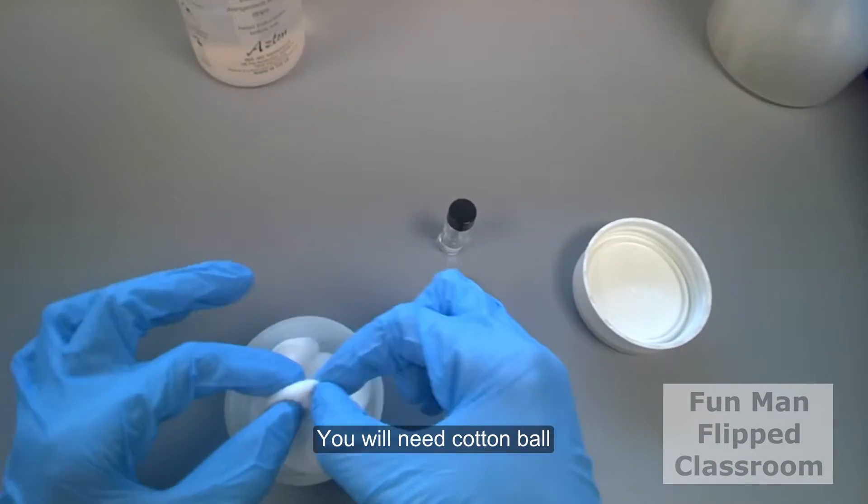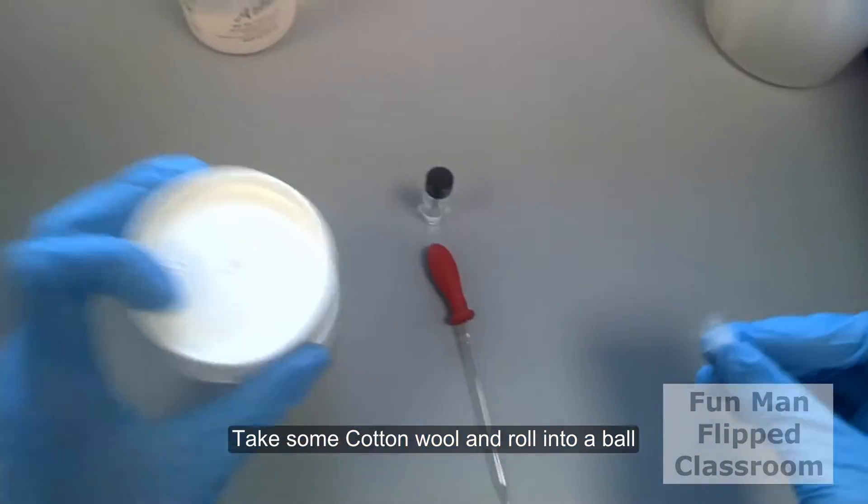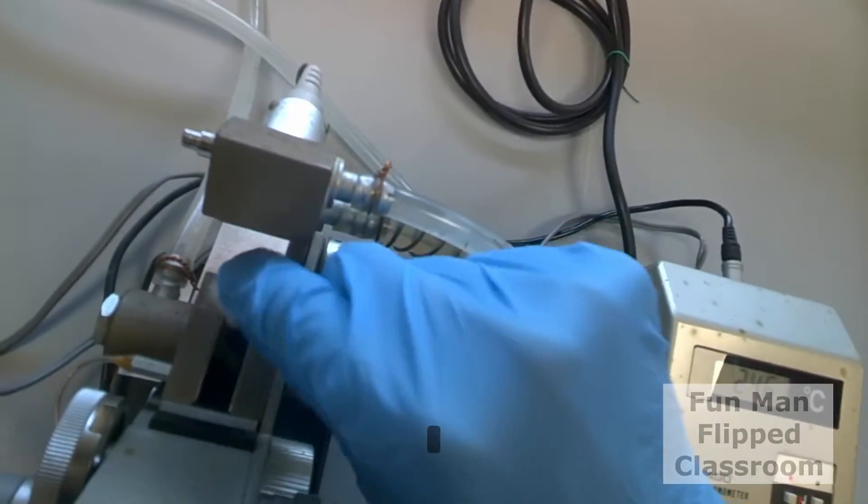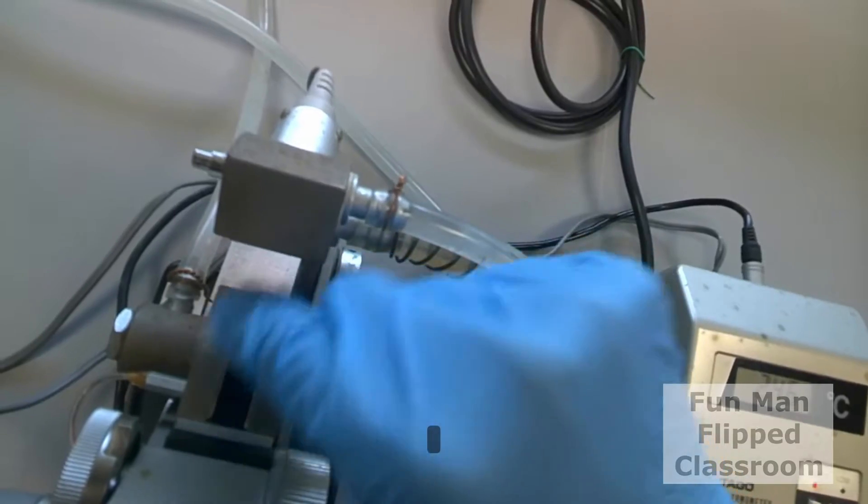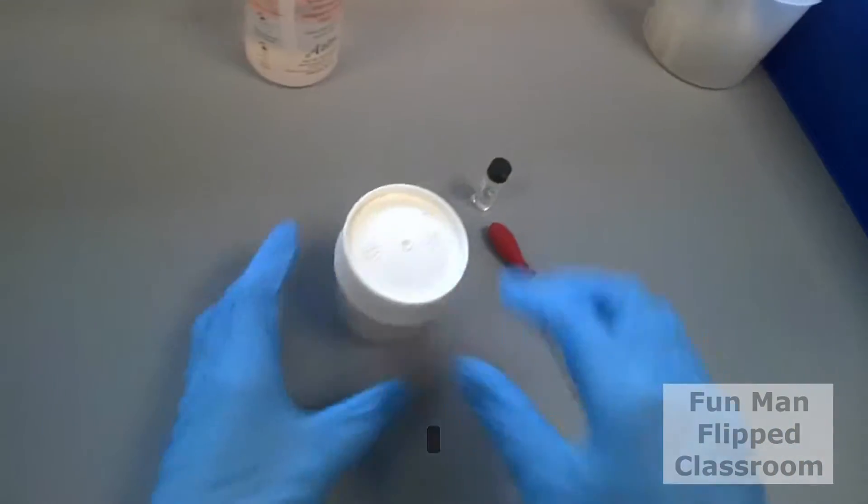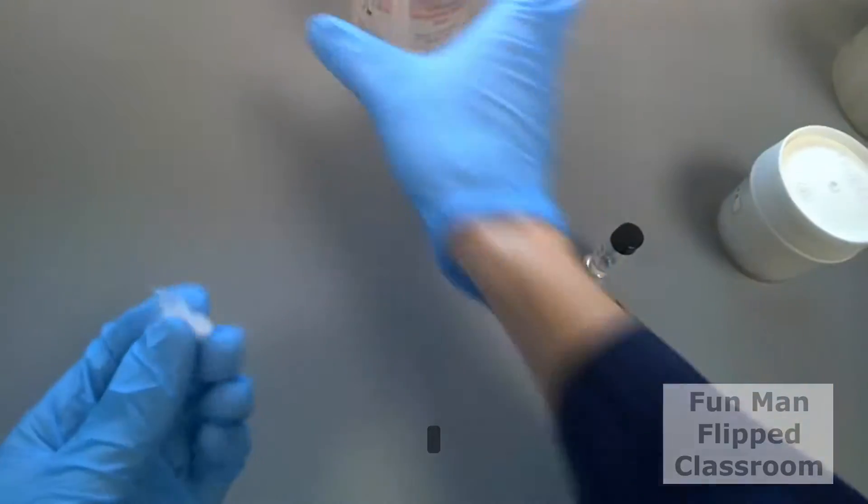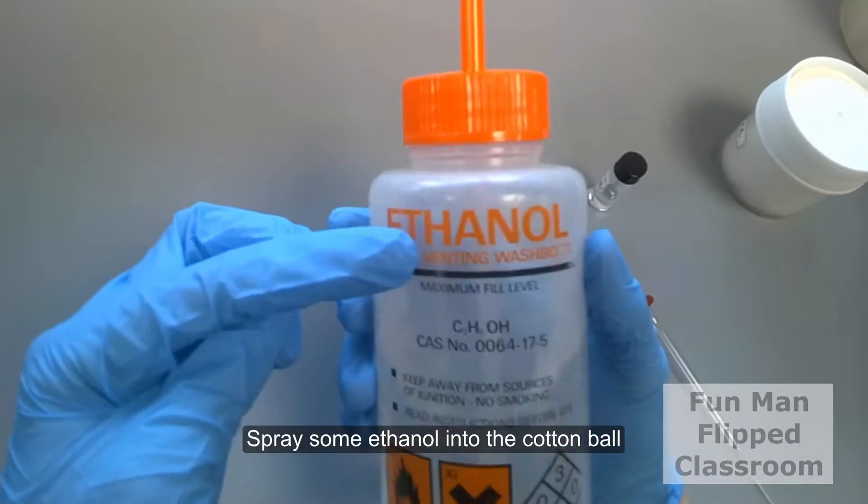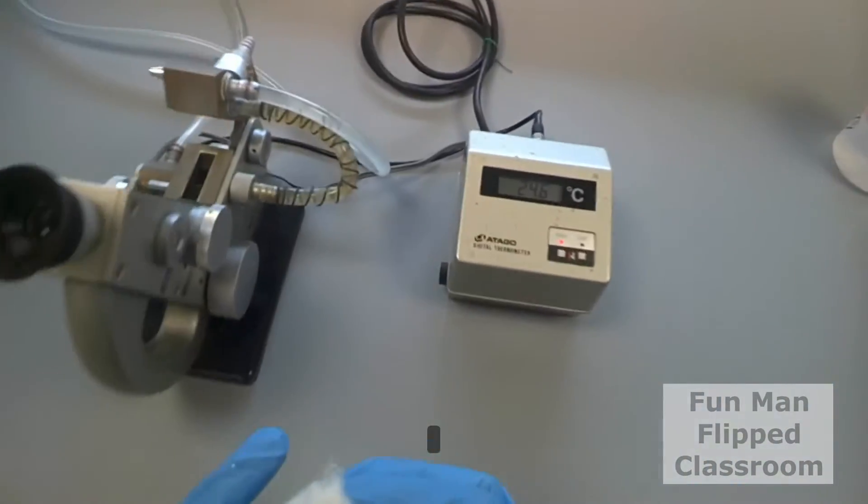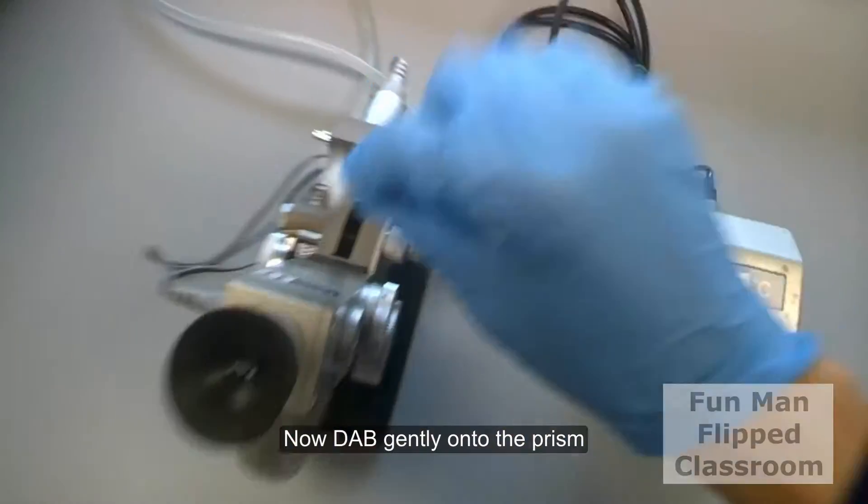You will need cotton balls. Take some cotton wool and roll into a ball. Take this dry cotton ball and lightly wipe the surface of the prism. Spray some ethanol into the cotton ball. Now dab gently on the prism.